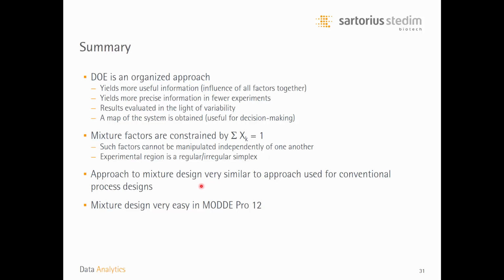So we have the same guided workflow in terms of the analysis wizard, and that approach was also discussed in the PowerPoint slides. So all in all, we can say that the approach to mixture design is very easy in MODDE Pro 12. It is easy to generate mixture designs, it is easy to analyze the mixture designs, and it's easy to communicate the results arising from mixture design.